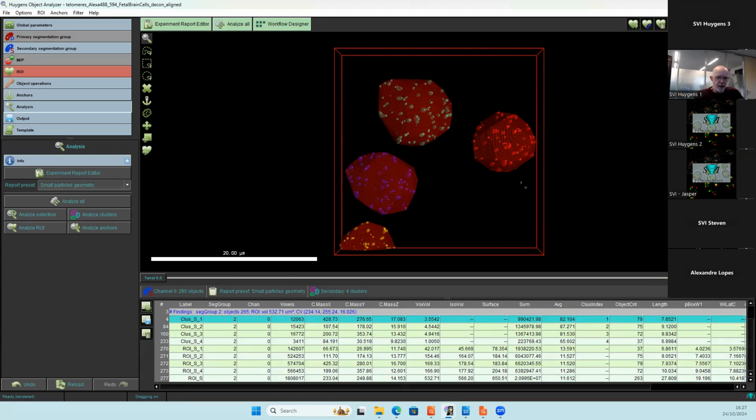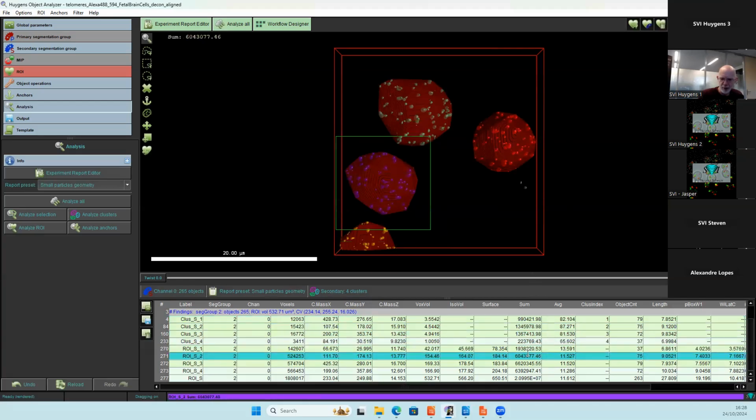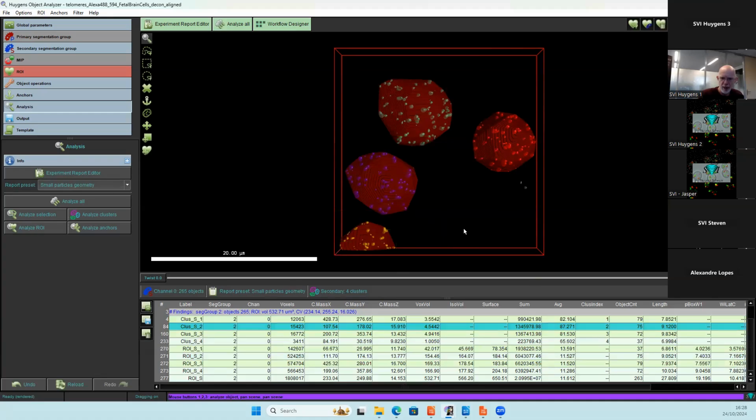Now, there are still those 2 annoying gray objects at the right of this cluster, or just below the cluster that is on the right of the image. So we want to include this in this cluster. And we can do that by selecting them from the table, holding the control button, but that is some work.